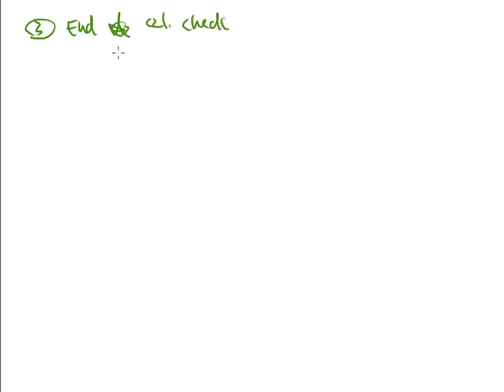And again, this is a solution that I've made. Maybe it's a 25 ppm. I'm going to run it as a sample, unless I have fancy software. And it's going to process this sample. It's going to take the absorbances or the areas, whatever kind of signal. It's going to process them against the cal curve, and it's going to kick me back a concentration. And it might be 24.96 ppm instead. And maybe that's good, and maybe I check off, and then I can wipe the sweat beads off my forehead because everything passes. Now, what's the purpose in all of these?